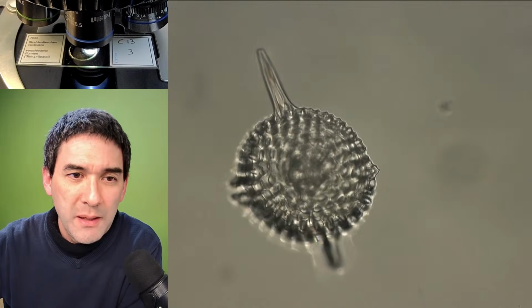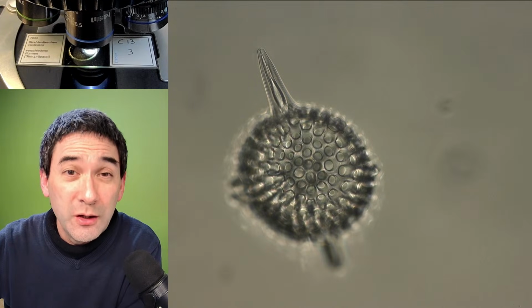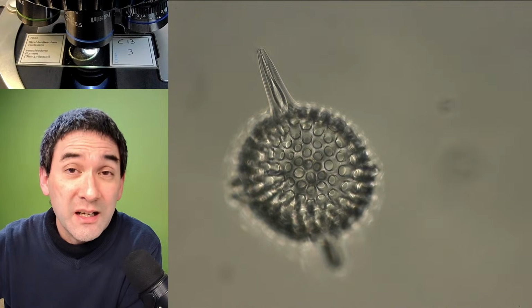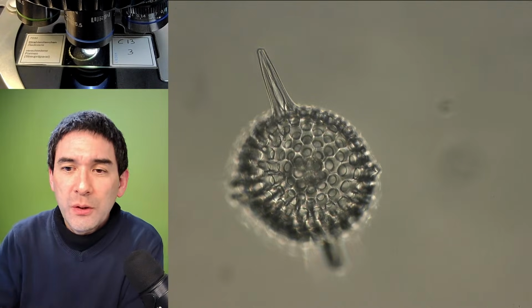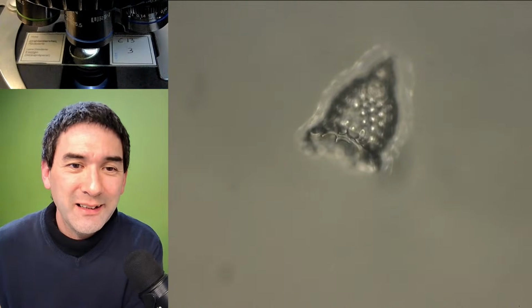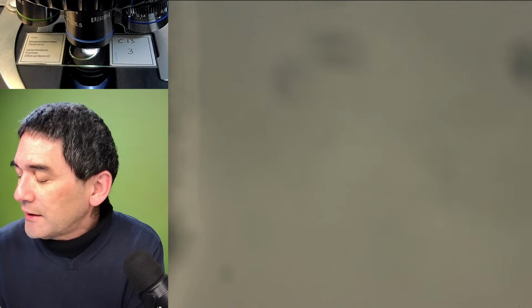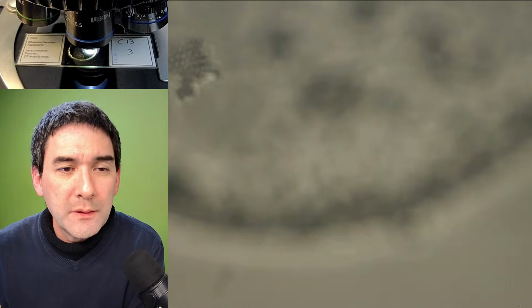So you can even try the free version called Helicon Focus. That's the one that I'm using for stacking, and there is also a free trial for that. Okay, so I'm just reading. Would you please add more biology relating to the slides? Pretty pictures alone are fine, but little value. Okay, fine. Unfortunately, I don't know where they were collected, those Radiolarians.